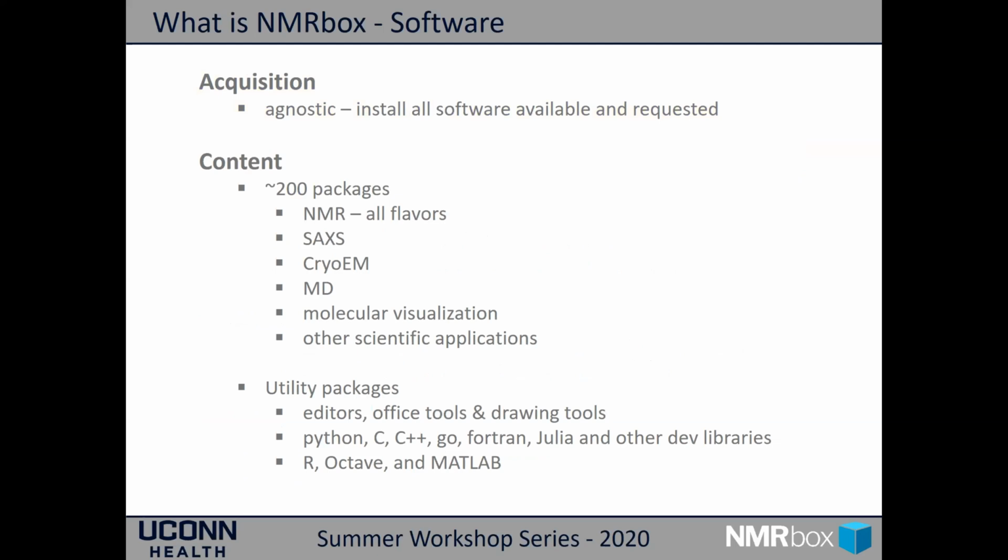So just a little bit about NMRbox when it comes to software. We are agnostic in our software acquisitions. We'll install all software that people request. At this point, most of our software is being installed by user requests. So if NMRbox does not have software packages you'd like to see, you can send us a support email, and we will attempt to include it in the next release.